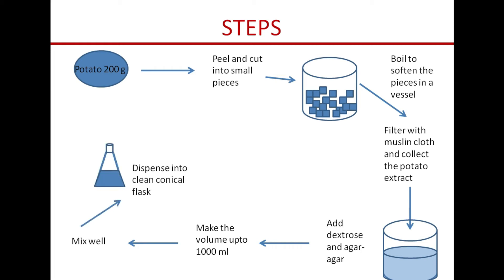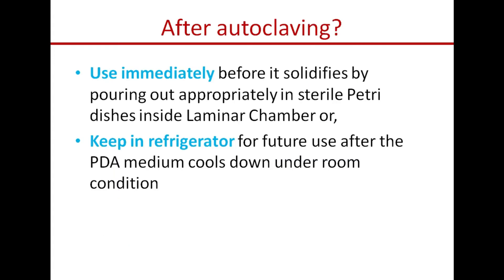We make the volume up to 1000 ml using distilled water, then mix and dispense the PDA medium into clean conical flasks. For a 250 ml size conical flask, fill up to 200 ml level - so for one liter of medium we get five flasks. After dispensing, plug the conical flasks and autoclave at 121 degree Celsius, 15 pounds per square inch pressure, for 15 minutes, to kill any microbes that may have contaminated the media during preparation.